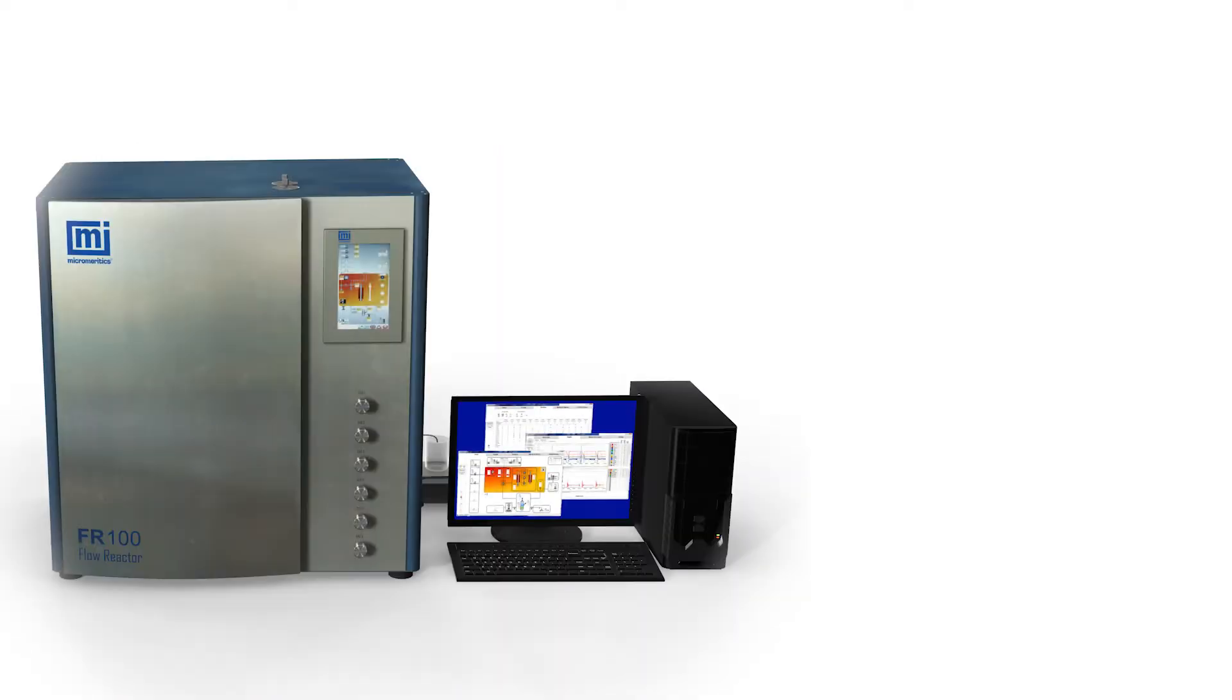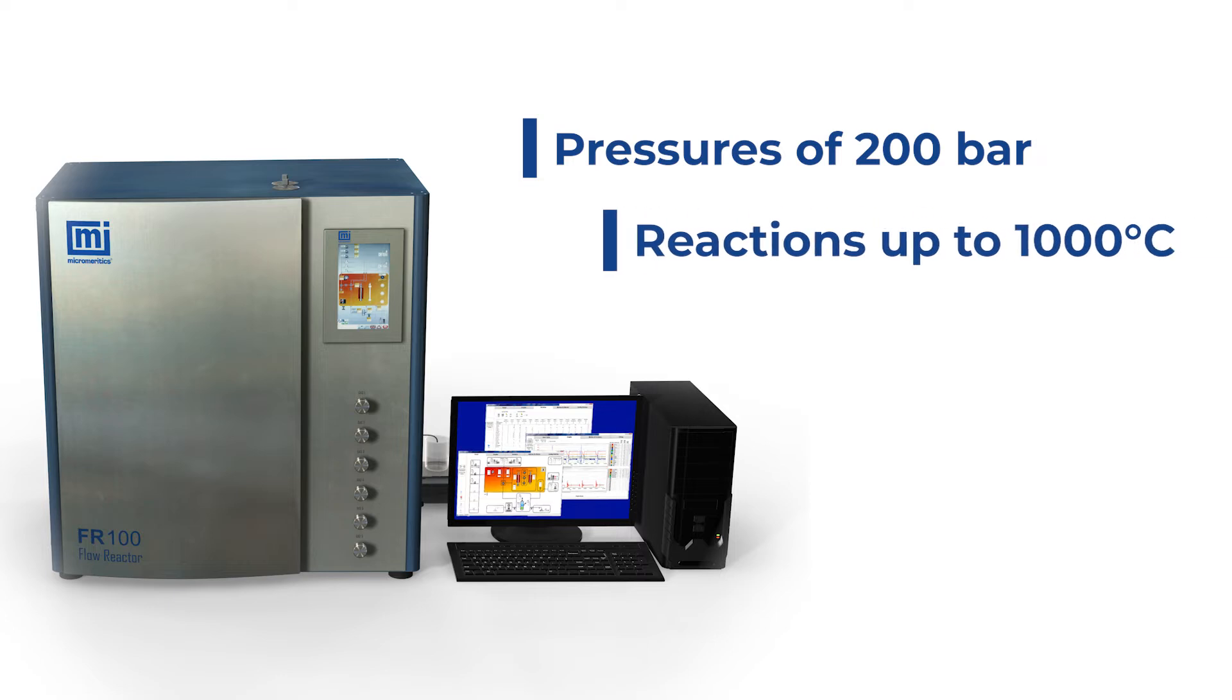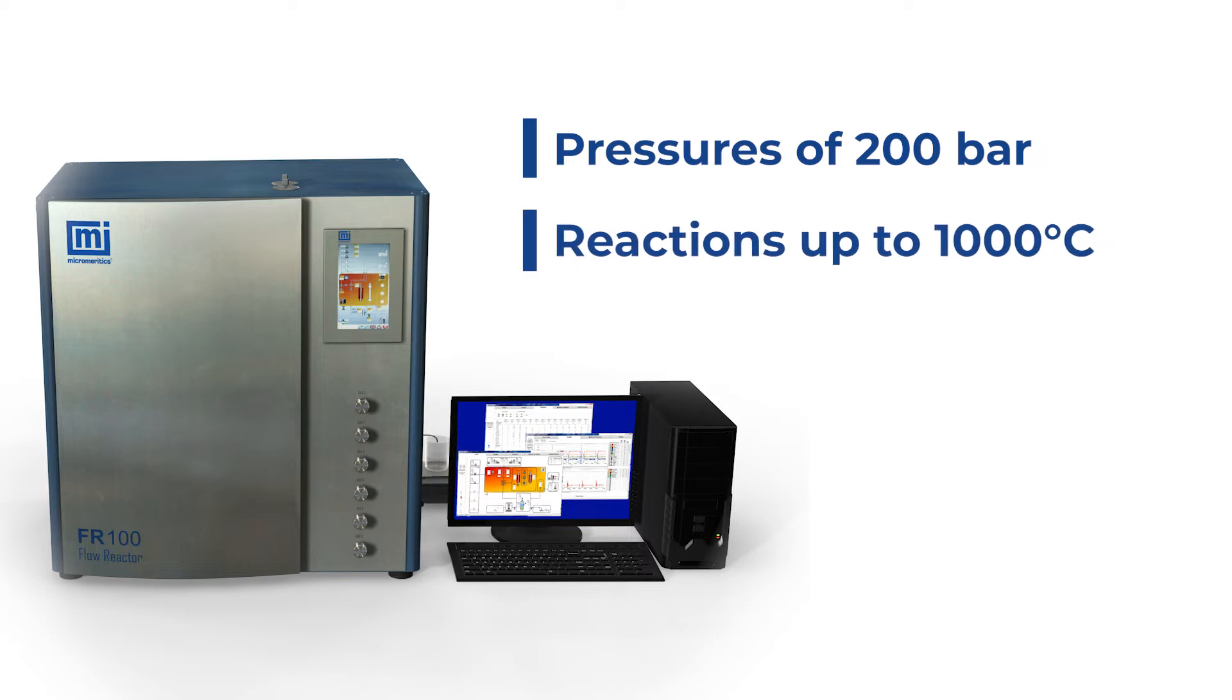The FR100 operates with flows that range from milliliters per minute to liters per minute and pressures to 200 bar. Reaction temperatures can reach up to 1000 degrees Celsius.